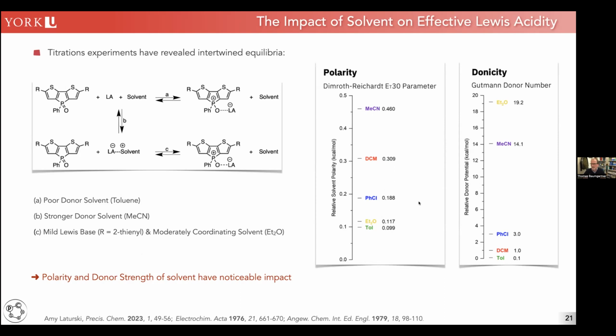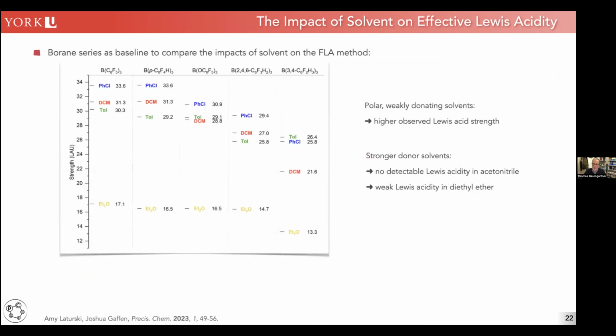So you can see that solvents can have effects that go in the same direction or in the opposite direction. We made it a little more challenging to determine this, but again, we were able to piece this together. And ultimately, this is a borane series here.